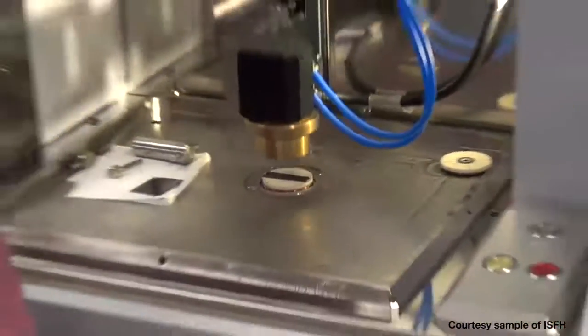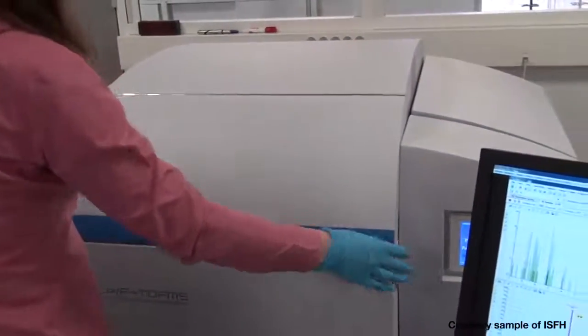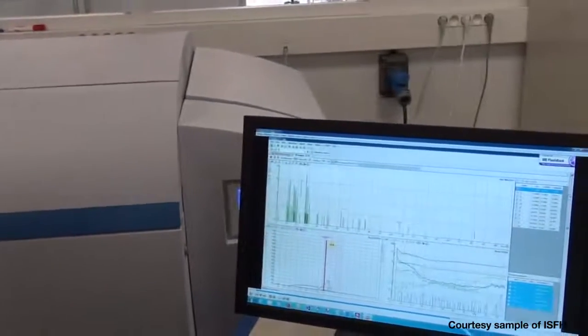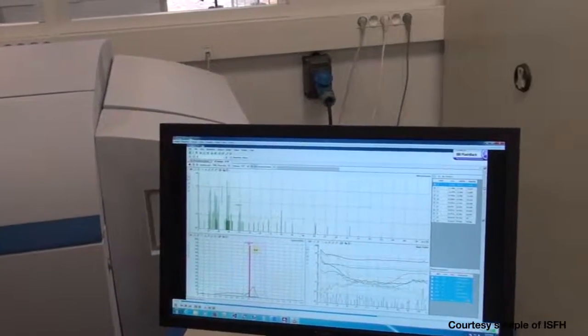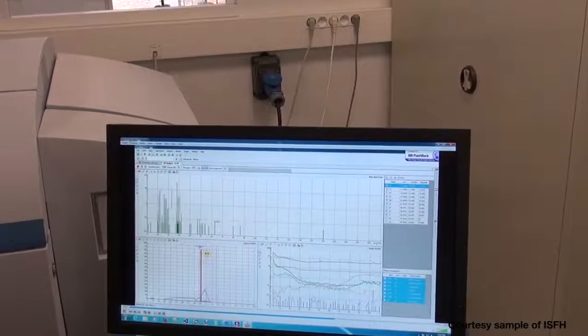The applicator brings the pulsed radiofrequency excitation and cools down the sample. After a short 20 second rough pumping of the source, a 3 minute argon flush is run to remove residual gas from the source chamber.